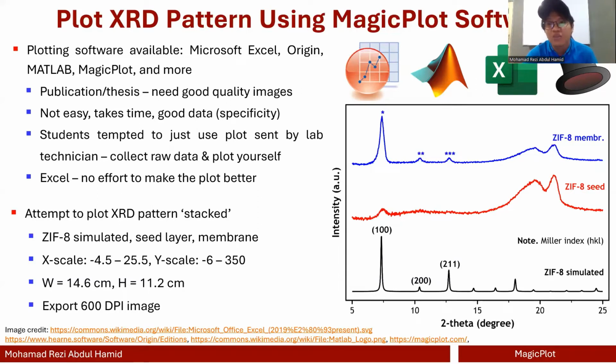For example, I saw most of the students don't create a border for their plot. But if you see a published work in a high quality journal, like maybe Nature or Science or Angewandte, or even ACS publications, you can see that they all share a similar characteristic where they have a border.